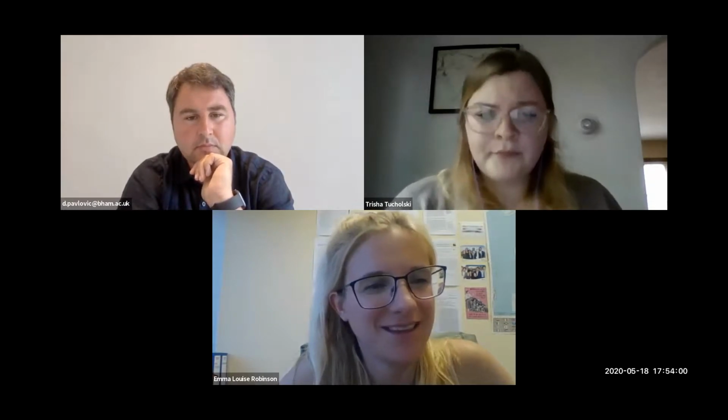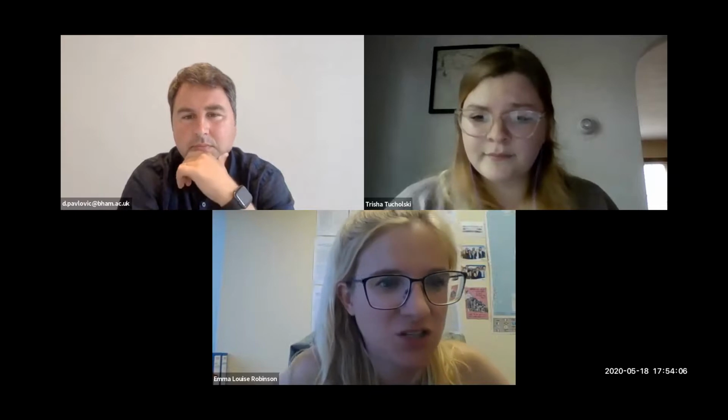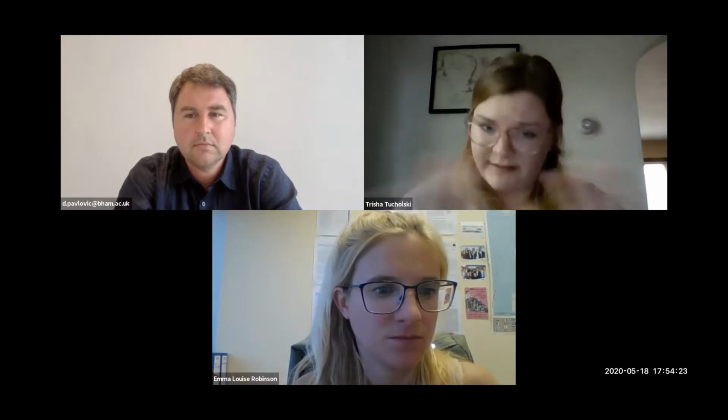Yeah, thank you. The next question from Conrad Winkles says, great talk. Do you see retention time shifts in regard to degree of phosphorylation, or do they coelute with non-phosphorylated proteoforms? Yeah, that's a great question. In terms of their elution times, those are going to be based on the hydrophobicity differences.